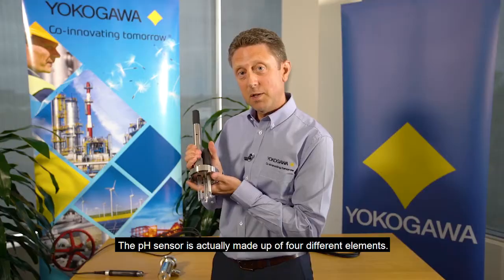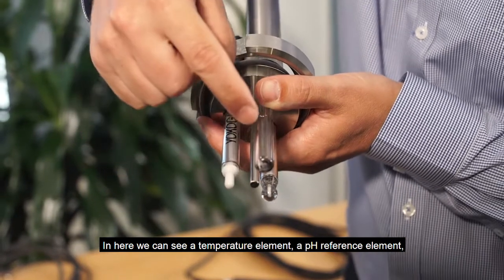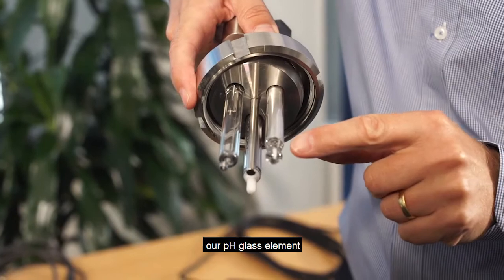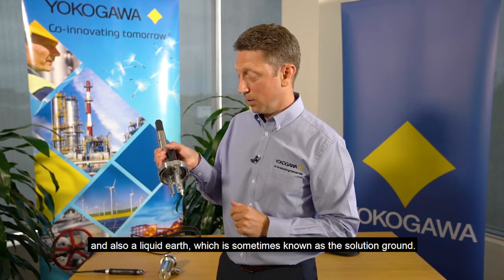The pH sensor is actually made up of four different elements. In here, we can see a temperature element, a pH reference element, our pH glass element, and also a liquid earth, which is sometimes known as the solution ground.